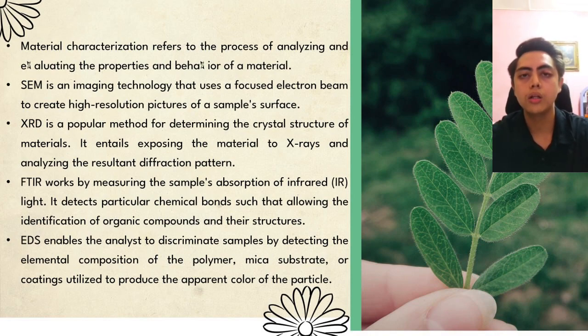We will do another technique, which is EDS. EDS is combined with SEM. EDS enables us to discriminate samples by detecting the elemental composition of the polymer, mica substrates or coating utilized to produce the apparent color of the particle.